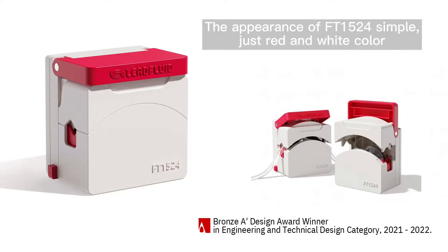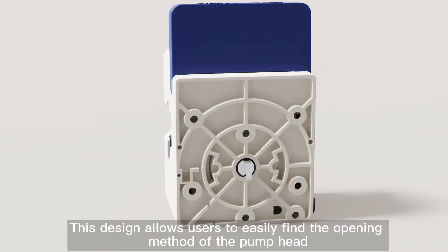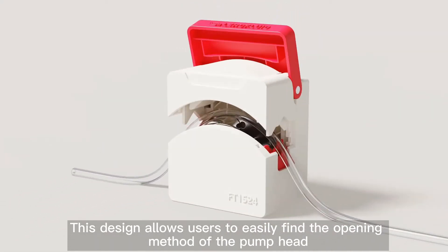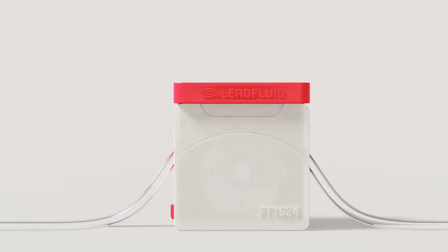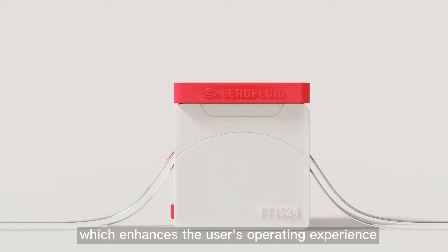The appearance of FT1524 is simple — just red and white color. The red parts are functional. This design allows users to easily find the opening method of the pump head, which enhances the user's operating experience.